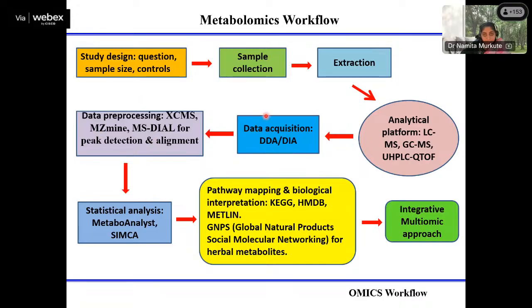Now after acquisition of your sample, data processing is done. In this data processing, there are different search engines. You have one spectrum, your practical spectrum which you get from your mass spec, and this search engine searches different databases and sees whether your practical spectrum matches any theoretical spectrum present in these databases.